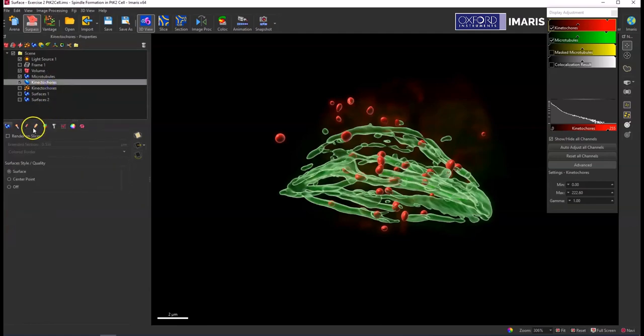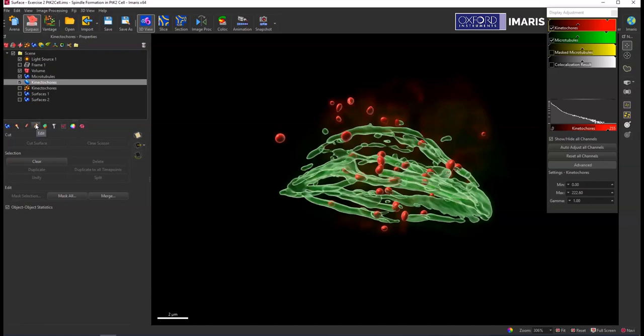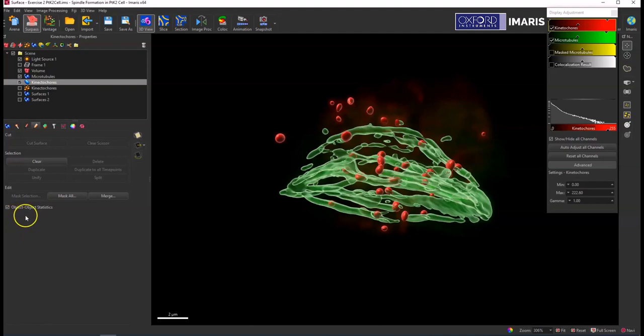This needs to be done for any surface objects that you want to compare to each other or spots objects. This feature is not available for cells, so just make sure that you have this turned on for any of the surpass objects that you want to compare.